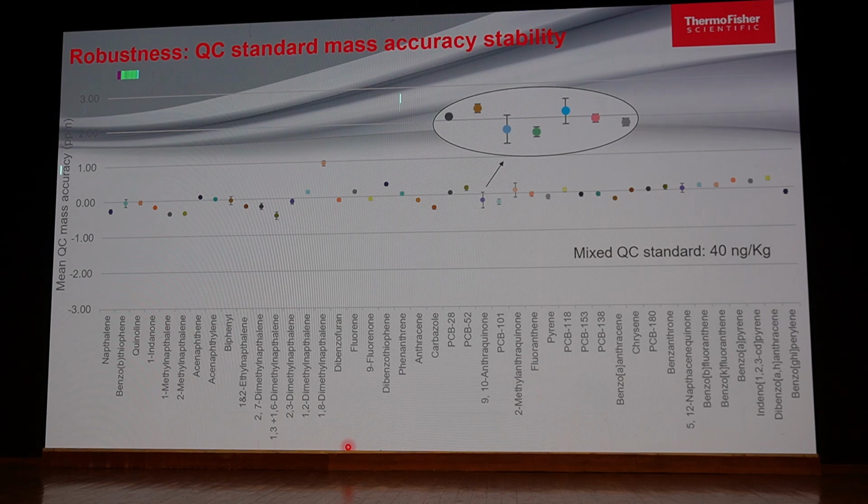So here you can see that you have a 1 ppm margin for your instrument by having the internal standard calibration approach, and if there is no internal standard, you are using an external standard approach. Without internal standard application, you have a 3 ppm margin. You can see that all results are within a 1 ppm margin, and you are getting very nice results. So that gives us confidence that the method, including your resources and all the configuration, is providing you confident results, and those are repeatable and rugged results. So that is the level of confidence you can show where you wanted to demonstrate your method is fit for purpose.